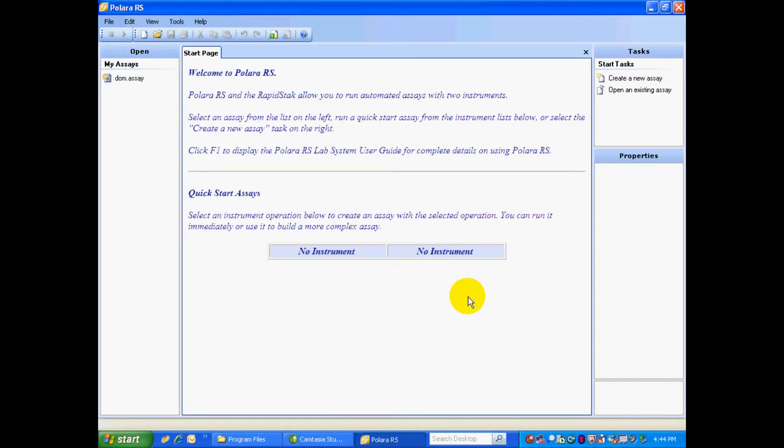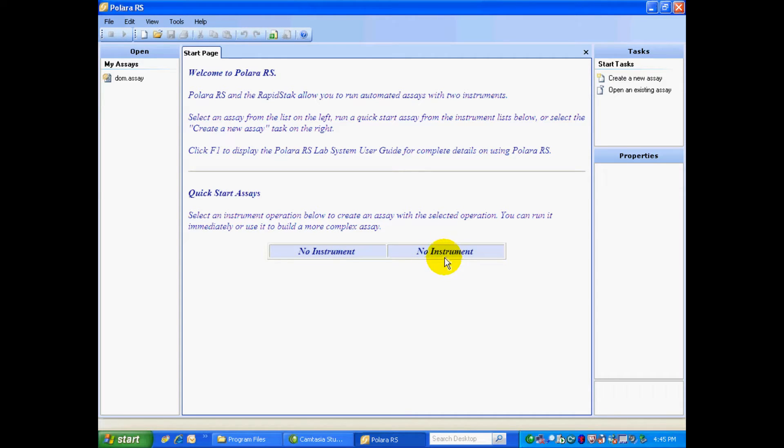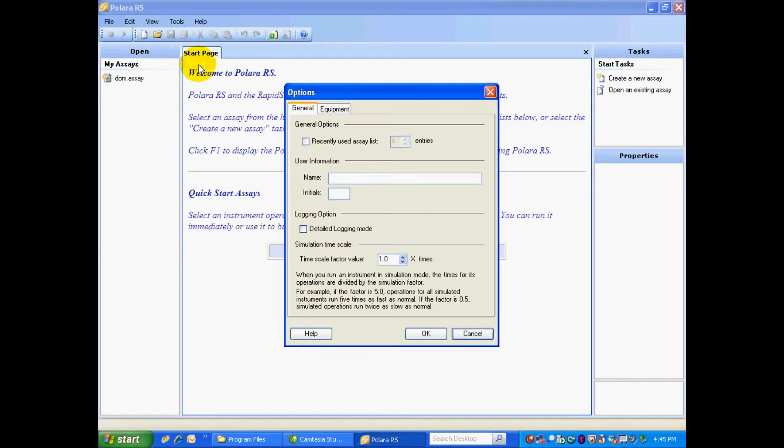This is the welcome page to Polara RS. The first thing we need to do is add some instruments. You can have an instrument on the left or an instrument on the right, as the Rapid Stack can automate up to two instruments at one time. To add an instrument, we're going to go up to the Ribbon Control, Tools, and Options.